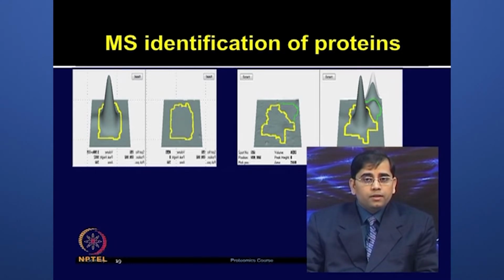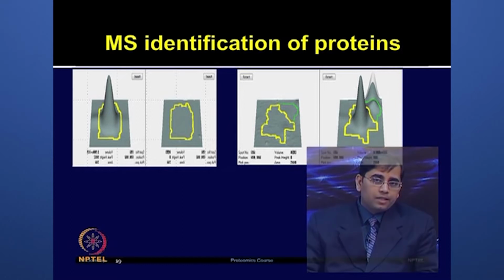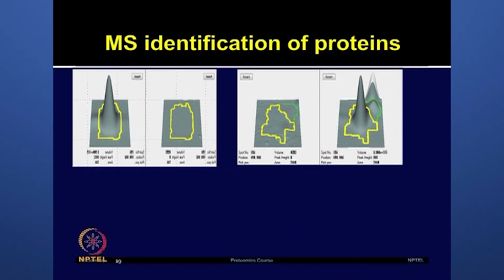They also found that there are 8 proteins which were overexpressed, and those included pigment epithelium derived factor, alpha-2-HS glycoprotein, complement factor H related protein and leucine rich alpha-2 glycoprotein. For the complete list of the proteins identified, you can refer to this manuscript. These are some of the interesting proteins which authors identified.